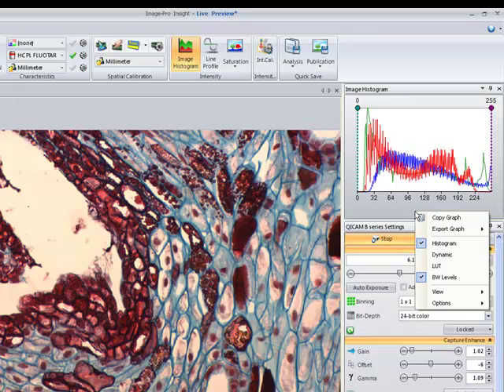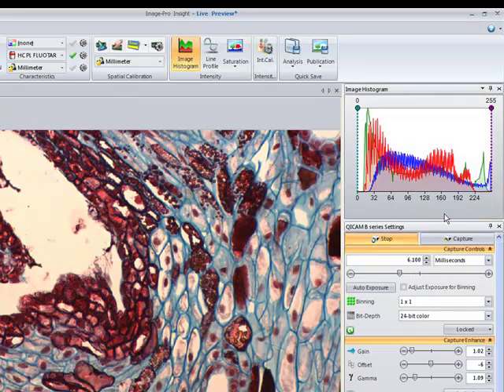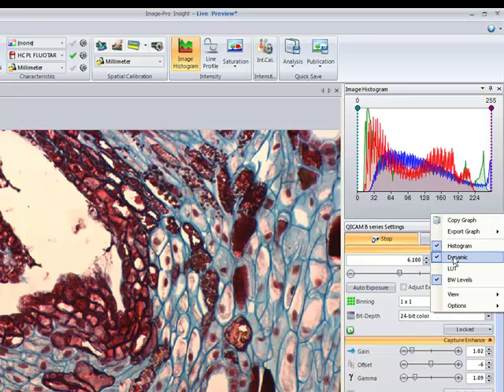If you right click on that histogram, you have options to export and change the display on the histogram.